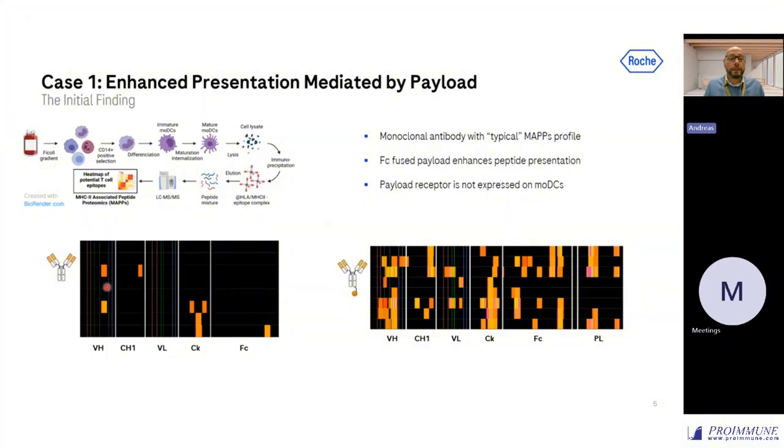And if we see those clusters popping up, those were peptides. For example, framework region 3 always has pretty strong peptides that bind to class 2, highly preserved for most IgG1s. Those are always detected, and this goes all along the sequence covering constant and variable region of the molecule.